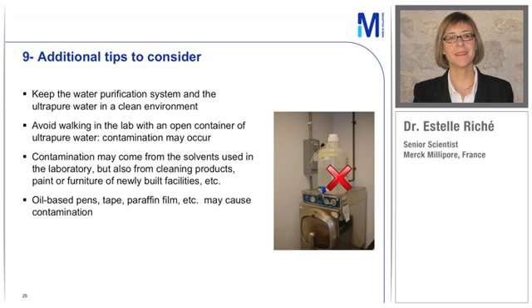All right, and as I'm getting towards the end of my presentation, I wanted just to give you a few additional tips really quickly. So one thing is, it's important to keep your water purification system as well as the container you may use to store water, even though we said it's better not to store it, in a clean environment. If you're storing water in, for example, a washroom that's quite dirty, or near a hood that is being used with strong organics, or that is quite dirty, then you may contaminate your high purity water. So it's really important to look around and be sure to place it in the best location in your laboratory.